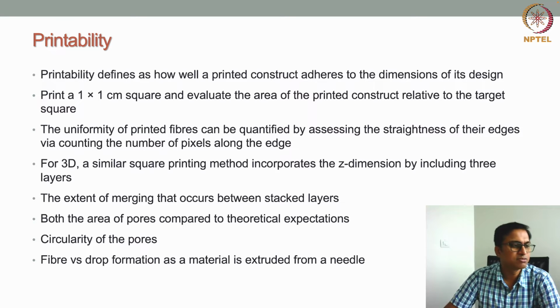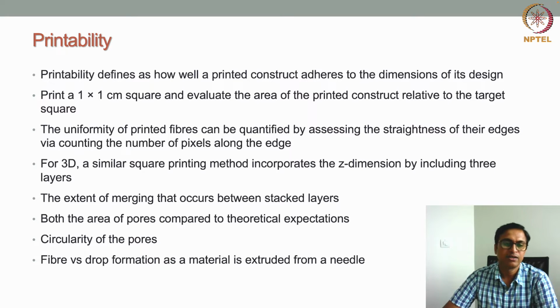So like this, researchers in the literature generally evaluate the printability of the bioink using any of these methods.